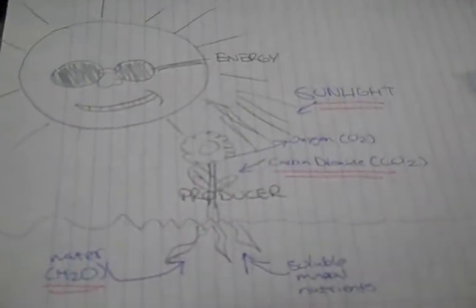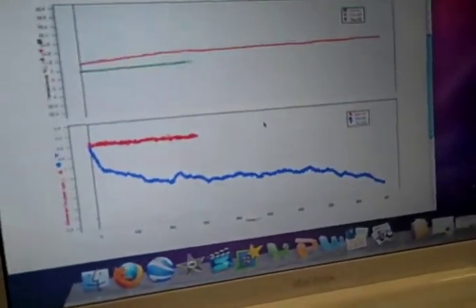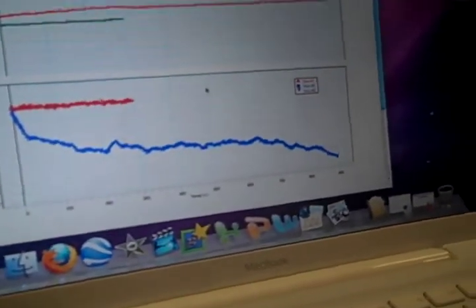As we can see, originally the oxygen level exhibited a significant change in the amount of oxygen when we started the stir bar up again. Another experiment which we could conduct: Adam, what do you predict for this experiment? I predict that when we add the Elodea plant, the oxygen concentrations will increase because the plant is producing more oxygen. So Adam, what are the results? The results are, when we added the Elodea plant, the oxygen concentration actually decreased while the temperature increased. Wow.